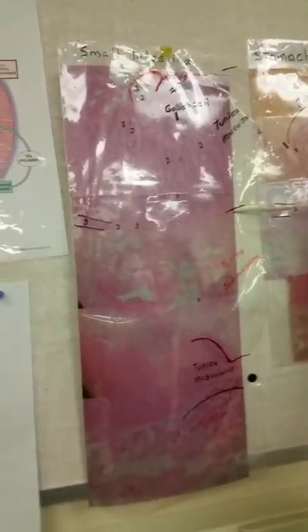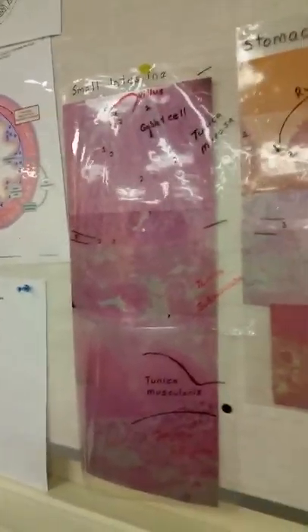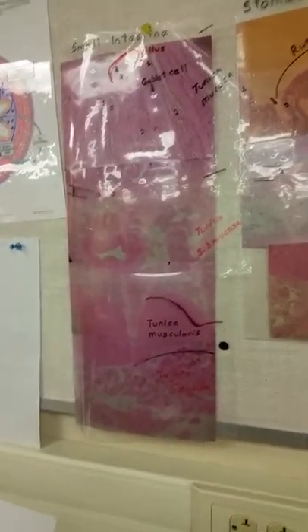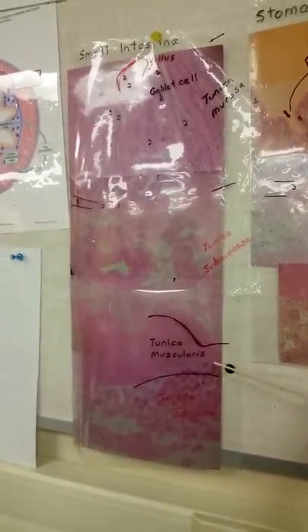And this layer here down — the tunica muscularis would be down here, up to this layer. The tunica serosa would be down here.